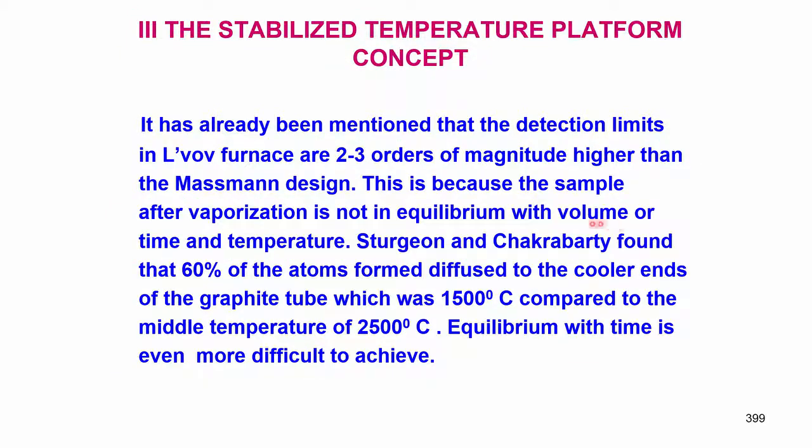Okay. So, this temperature programming has given rise to a sort of analytical concept that is known as the stabilized temperature platform concept.